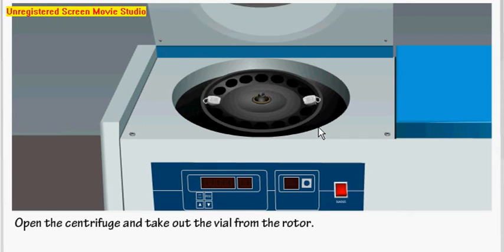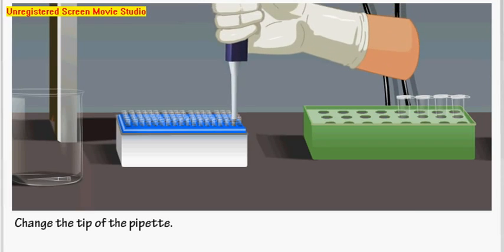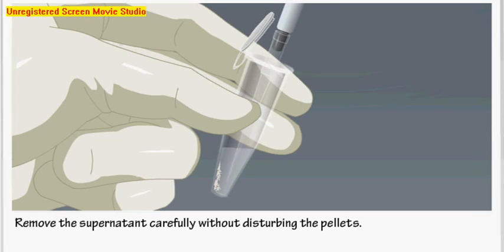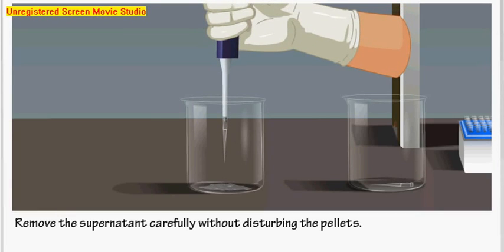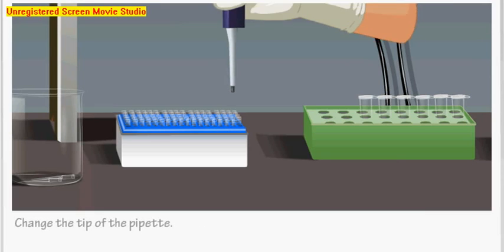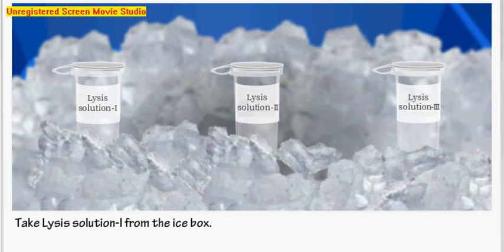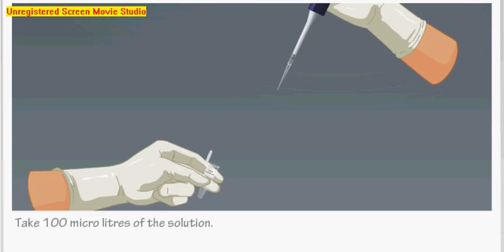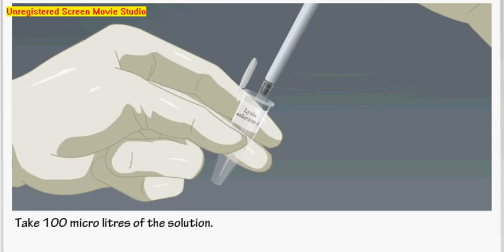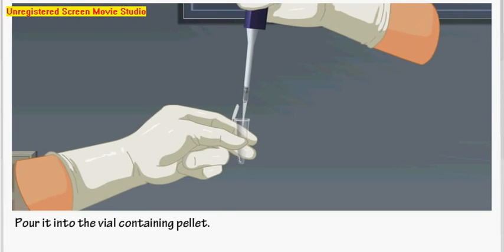Open the centrifuge and take out the vial from the rotor. Change the pipette tip and remove the supernatant carefully without disturbing the pellet. Put the vial back in its rack. Set the volume to 100 microliters, change the pipette tip, and take Lysis Solution 1 from the ice box. Add 100 microliters of Lysis Solution 1 into the vial containing the pellet, then vortex it using the vortex mixer.